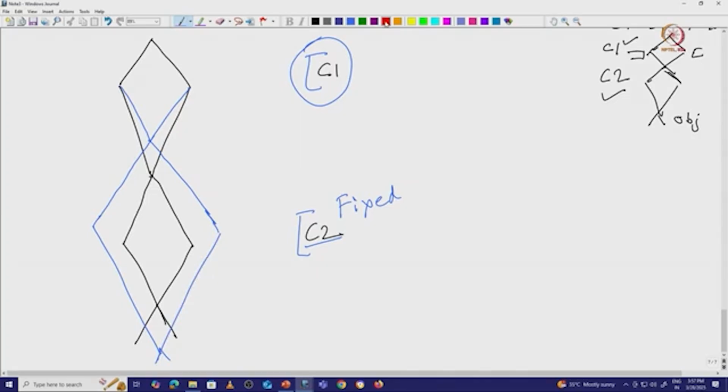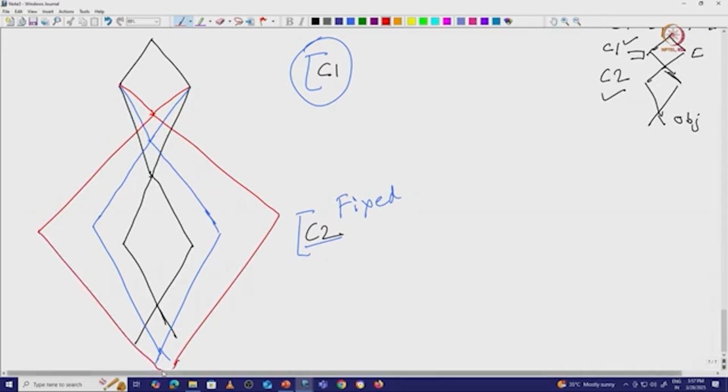Now consider another ray, a red one. The red ray will come like that, spread more, and it is going to converge below the plane. One more possibility, I am using this pink color: if beams converge something like that, then spread, this beam will converge something like that.